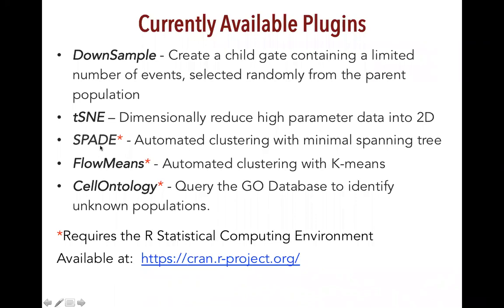SPADE, FlowMeans, and Cell Ontology require the R statistical computing environment — you have to set up R and download the packages for these algorithms before using them. When you run a plugin, you'll be asked to save your workspace. Each time you run a plugin operation, a file output is placed in a derivative folder named the same as your workspace and saved in the same location.